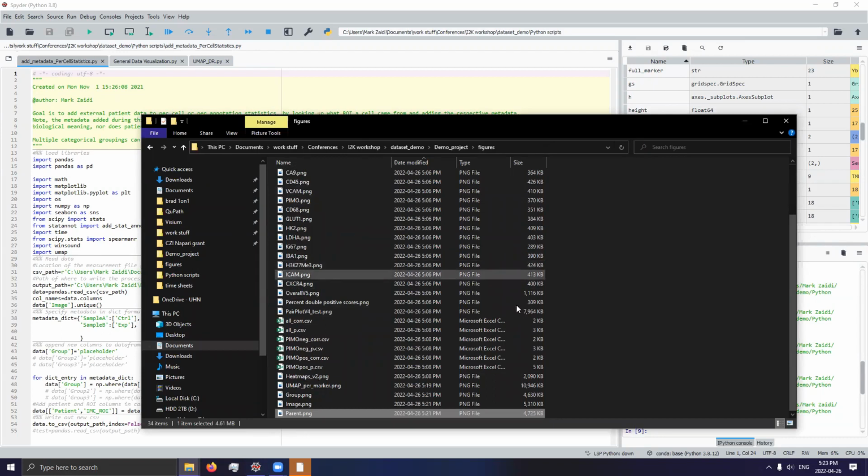But ultimately, you might be using some or all, or even none of these to visualize the data. This portion of data visualization is highly dependent on what you're exactly looking for in terms of your IMC or other multiplexed data set. In the case of tumor oxygenation, our ultimate goal for this project was to identify what genes are differentially expressed in response to variable oxygen concentrations.